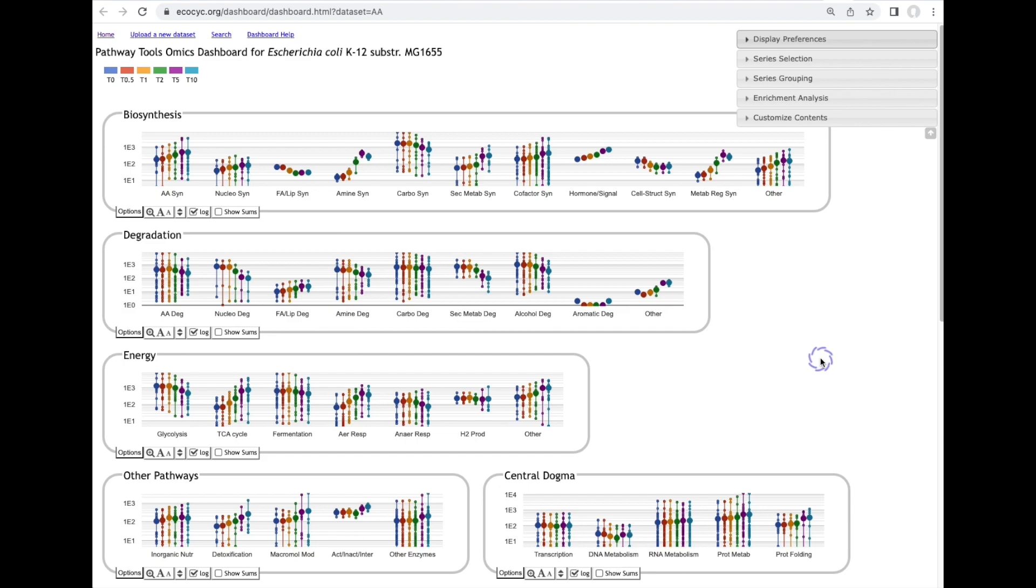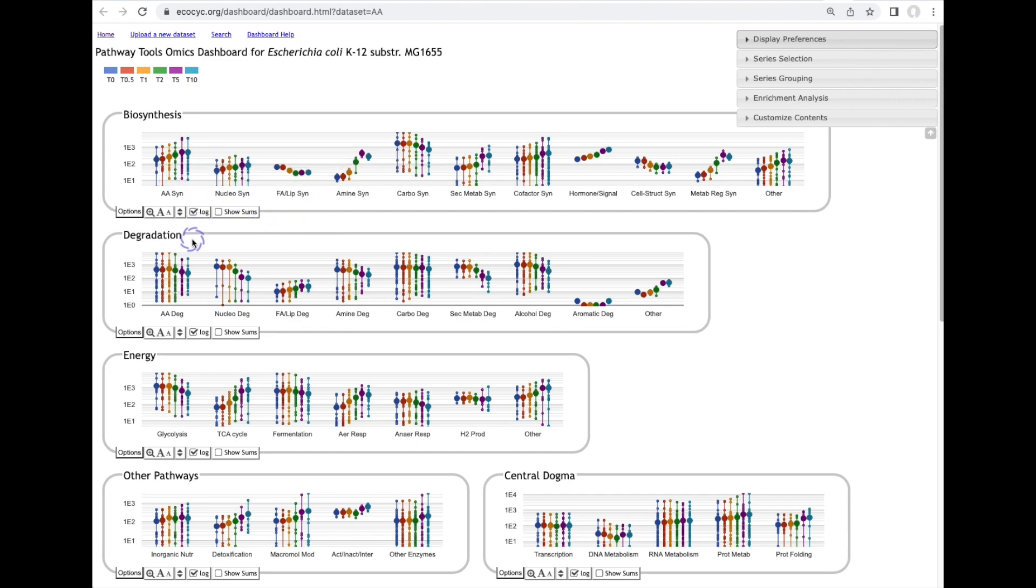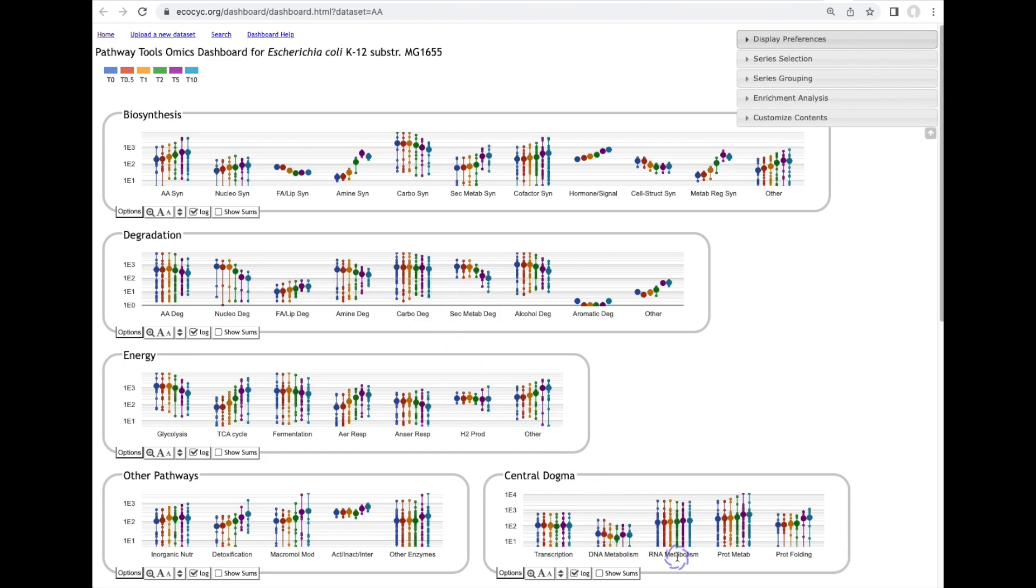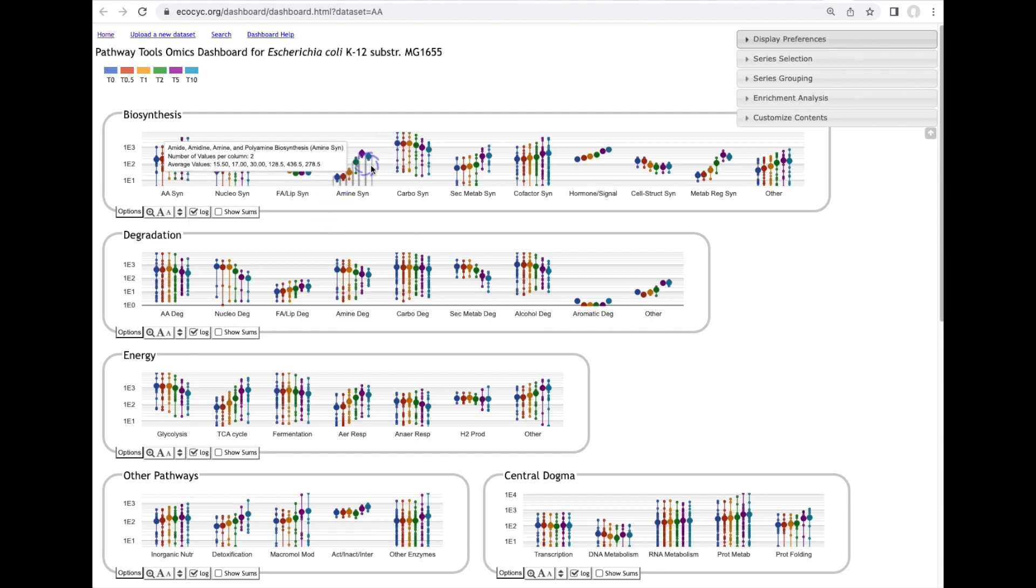Another tool in BioCyc for transcriptomics data analysis is called the omics dashboard. The omics dashboard here we're looking at the exact same omics data set in the omics dashboard which has different panels for cellular systems such as biosynthesis, degradation, and central dogma. And for each of those panels is divided into subsystems like amino acid biosynthesis, carbohydrate biosynthesis, carbohydrate degradation, DNA metabolism, RNA metabolism.